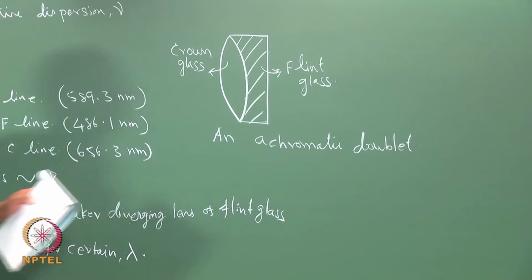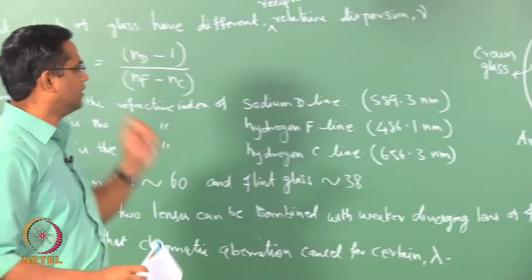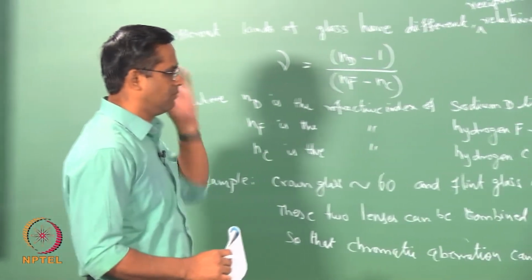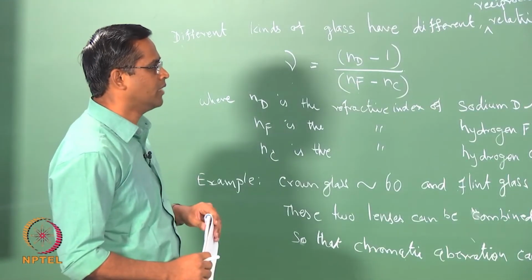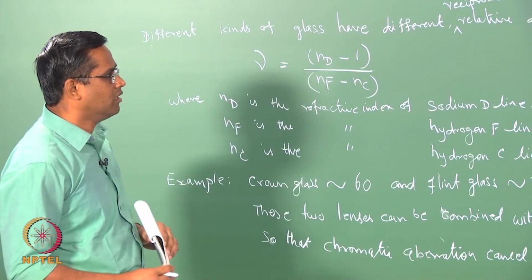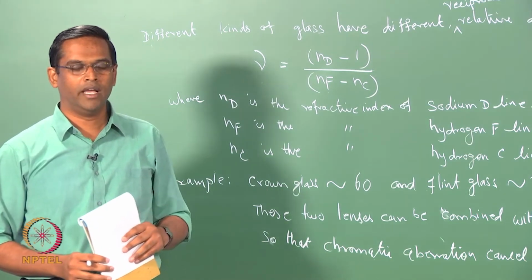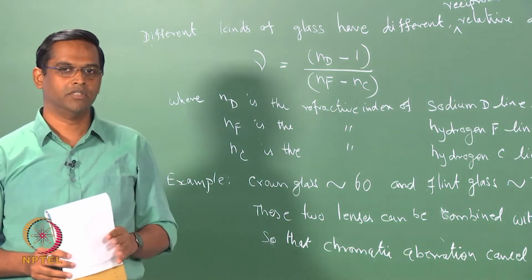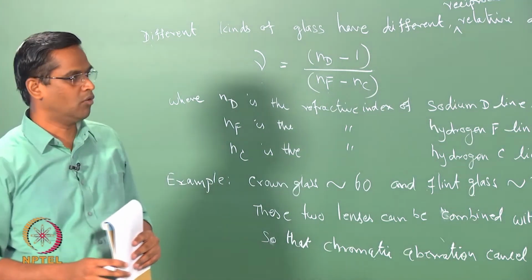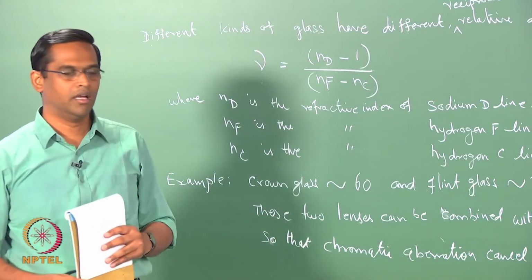So, I just gave an example of how these corrections are being made. It gives you an idea. Similarly, all those listed in that table follow certain procedures to take care of the kind of correction or the degree of correction which is required, based on which these objective lenses are classified.